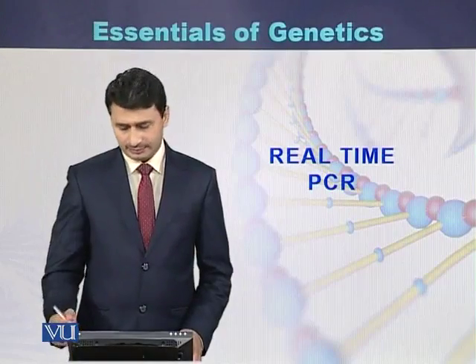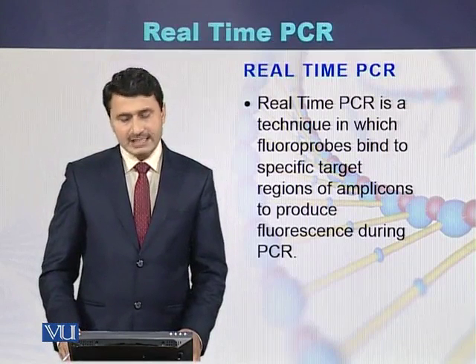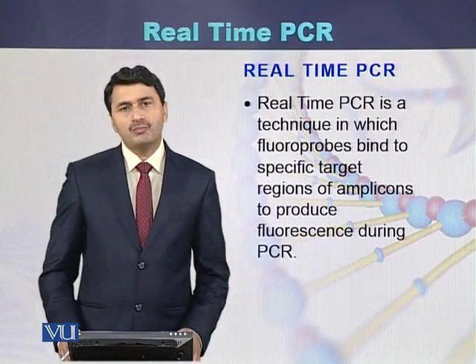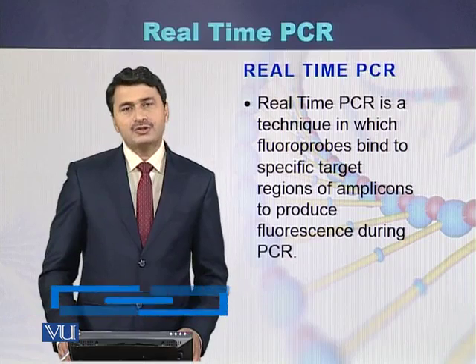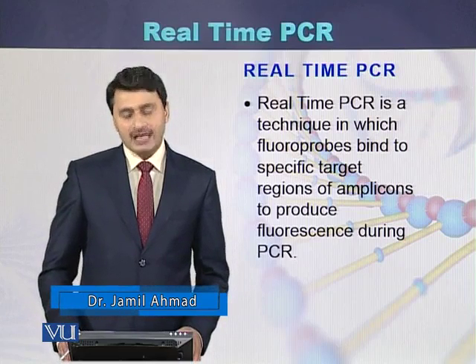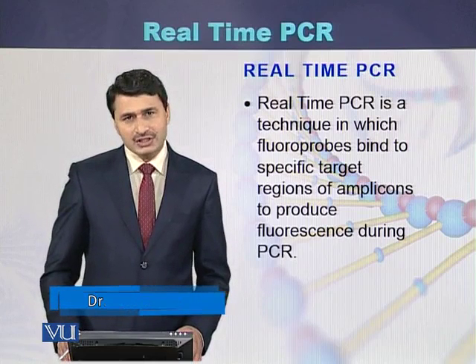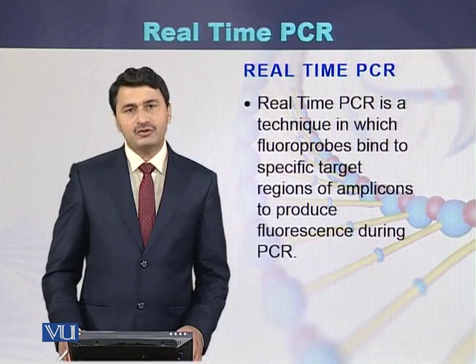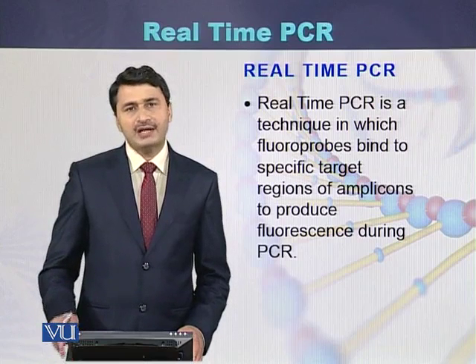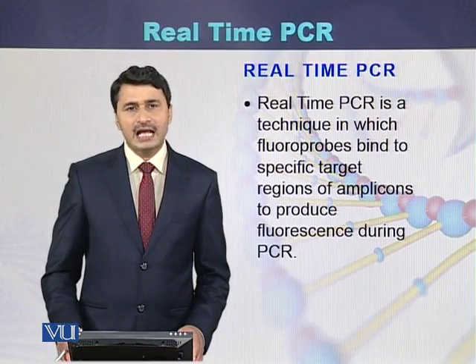Real-time PCR. Real-time PCR is a technique in which fluoroprobes bind to specific target regions on the DNA. Once the fluoroprobes bind to specific target regions, with the help of that fluorescence, the amplified product, or the quantity of the amplified product, can be measured.